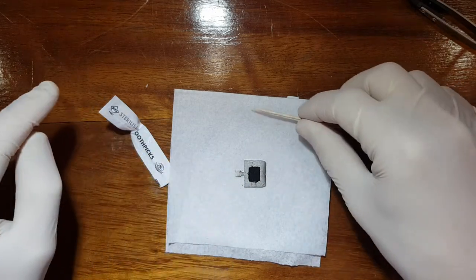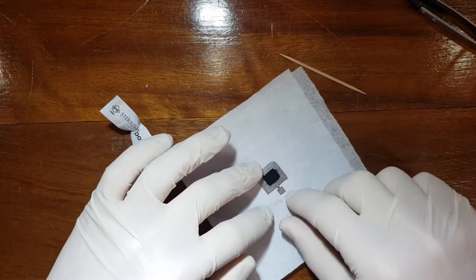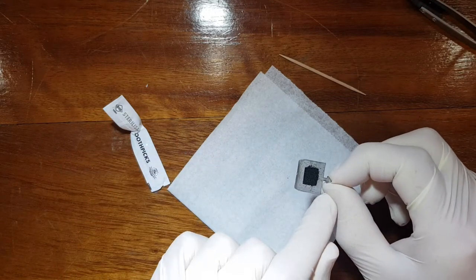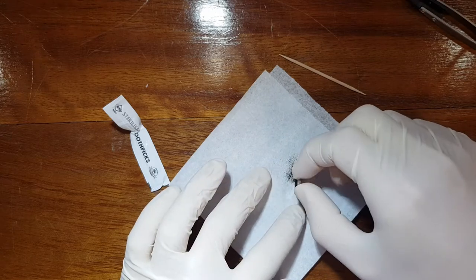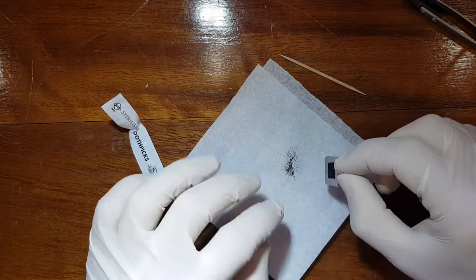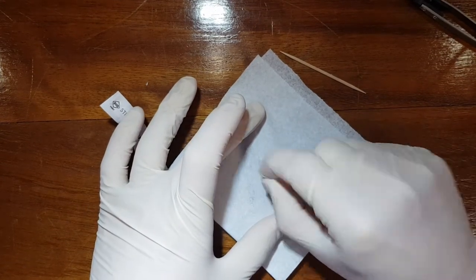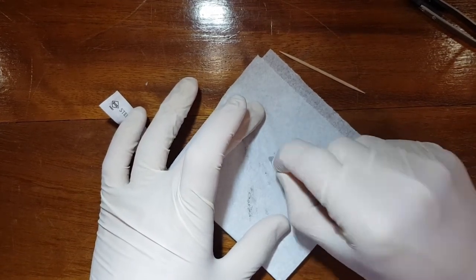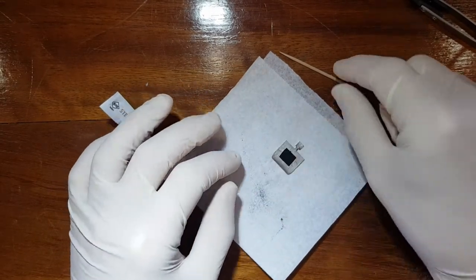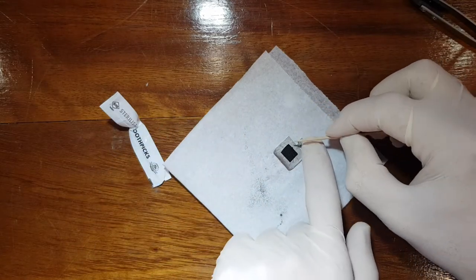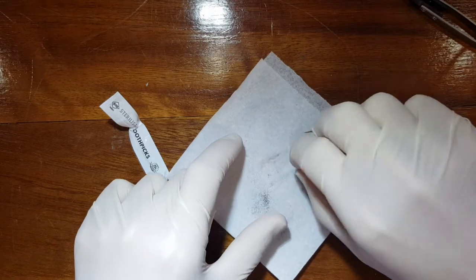So now you will see that the sample is obviously all over the place there and it looks quite messy. Now what you can do, you can pick up the sample by the little tab there, and you can actually tip the sample and tap it against the bench to get off with the excess material.